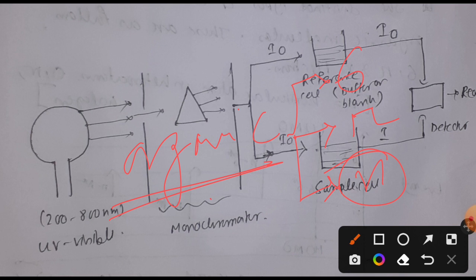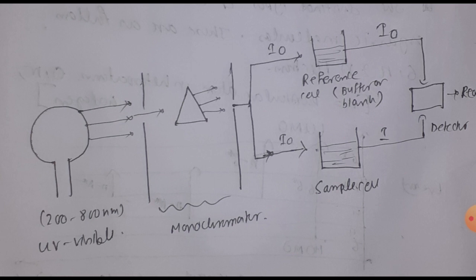As I have told you, UV visible spectroscopy facilitates transition of the valence electrons, so those electrons will undergo transition, right? That means sigma electrons will go from a lower energy state to a higher energy state, and so will pi electrons and n electrons. Now my question is, how is this transition determined? That means either sigma will undergo transition, or pi, or n.